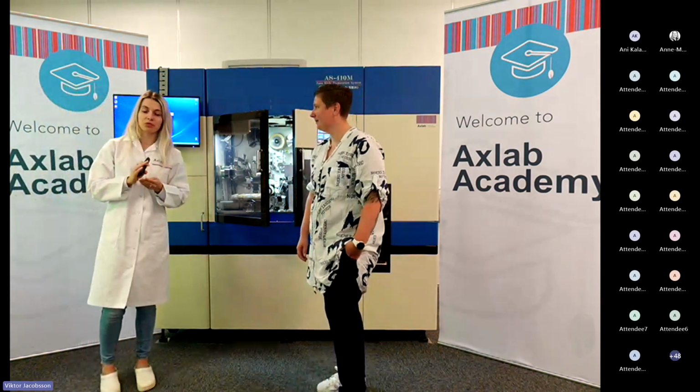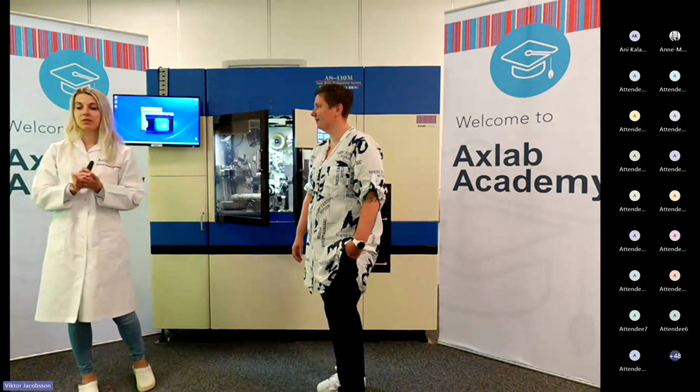How many different LIS systems is the AS currently valid on? Is it compatible with Epic Beaker? So I think we're up to 4 or 5 different platforms.